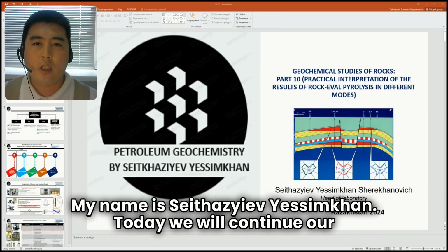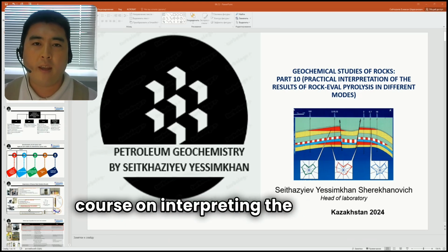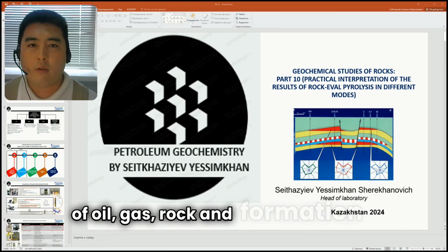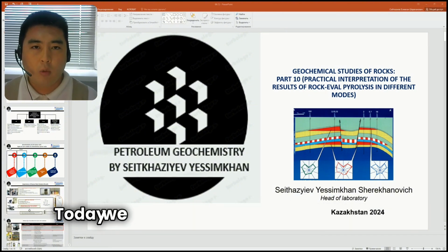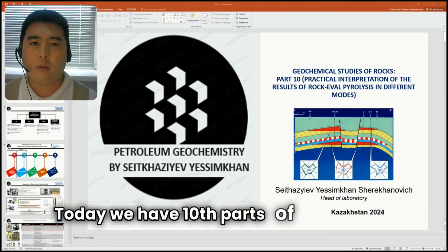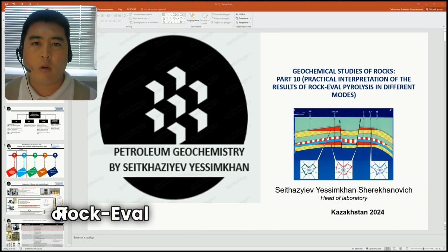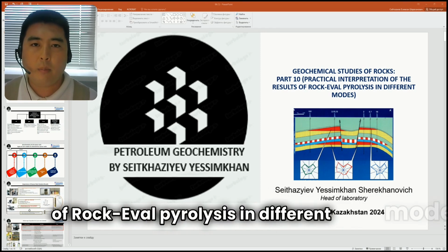Today, we will continue our course on interpreting the results of geochemical studies of oil, gas, rock, and formation water. Today, we have the 10th part of the seminar. Today's topic is practical interpretation of the results of Rock-Eval pyrolysis in different modes.